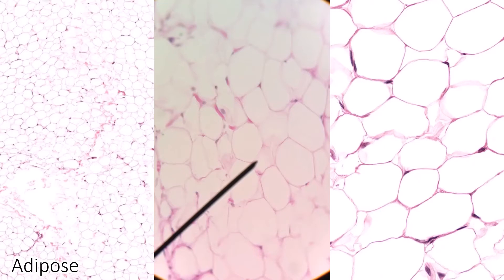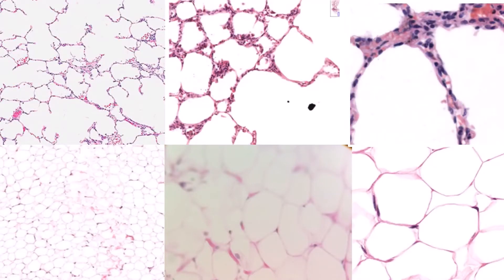However, what you want to pay attention to is the fact that in these examples of simple squamous, you have multiple squashed squamous pancake cells that are kind of holding hands to make a circle. And in adipose, what you're seeing is this bubble is one single adipose cell that has been filled with fat, so it's all stretched out.